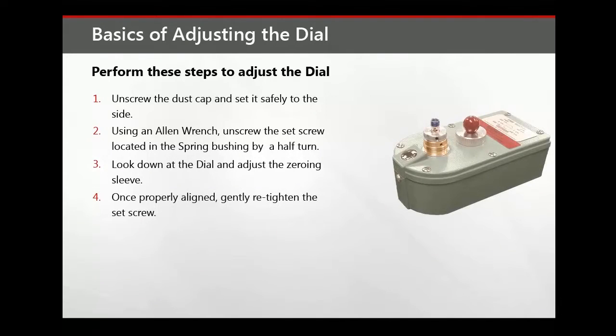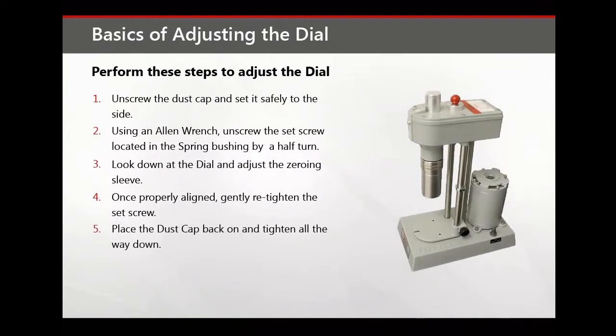Once properly aligned, gently re-tighten the set screw. Finally, place the dust cap back on and tighten all the way down.